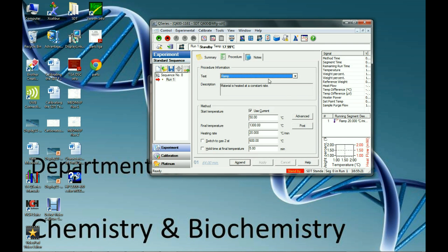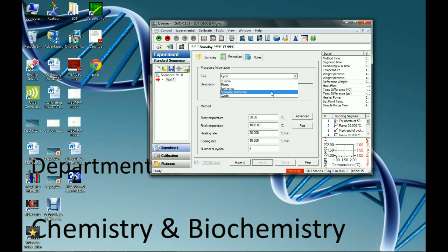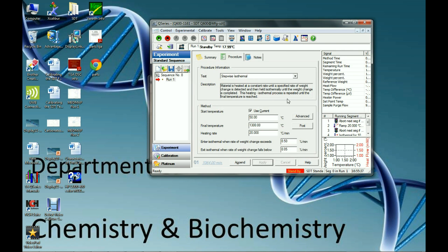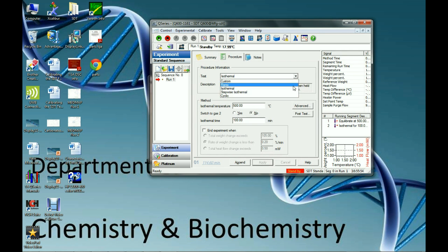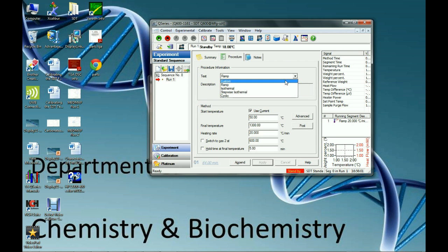So right now we have it set on ramp. There are four different methods you can do. Cyclic is material is heated and cooled for multiple cycles. Stepwise isothermal is increasing the temperature, holding it, increasing it, holding it. Isothermal is just one big increase and then hold instead of multiple ones. And then ramp is just heating the sample at a constant rate. And then custom is anything in between.